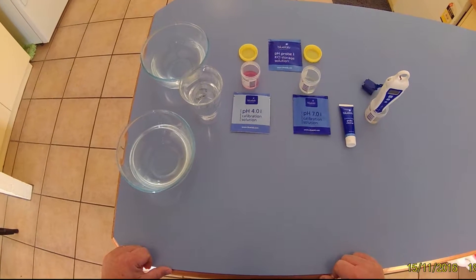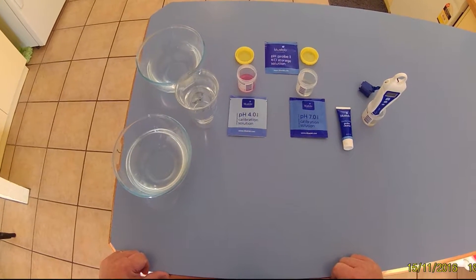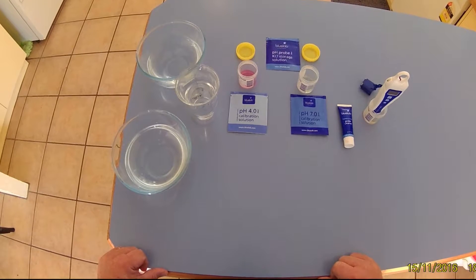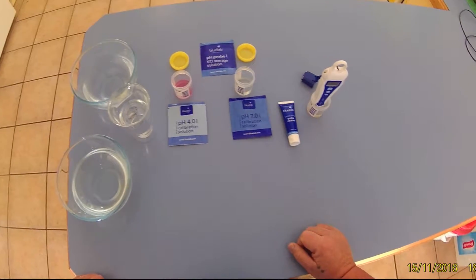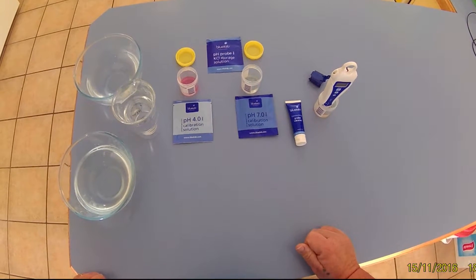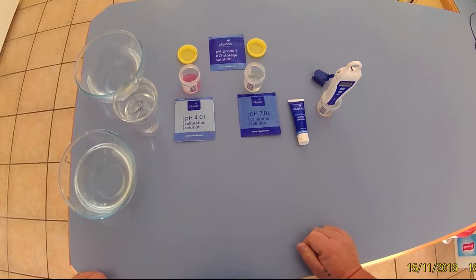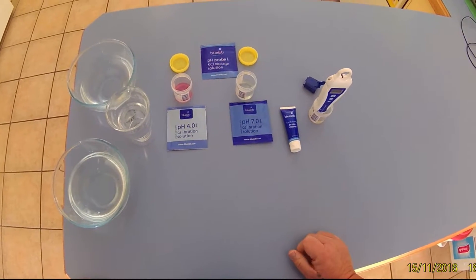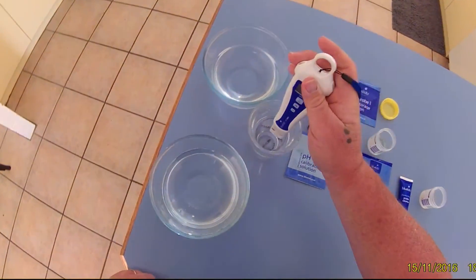What I'm going to do this time is go through the calibration of the Bluelab pH pen. You need to have the pen hydrating inside the KCl storage solution for the last couple of days, so that's pretty much done. From there, you just have to rinse that out in some fresh water.